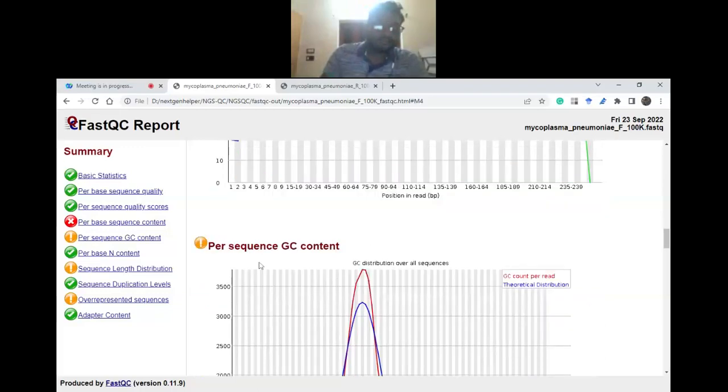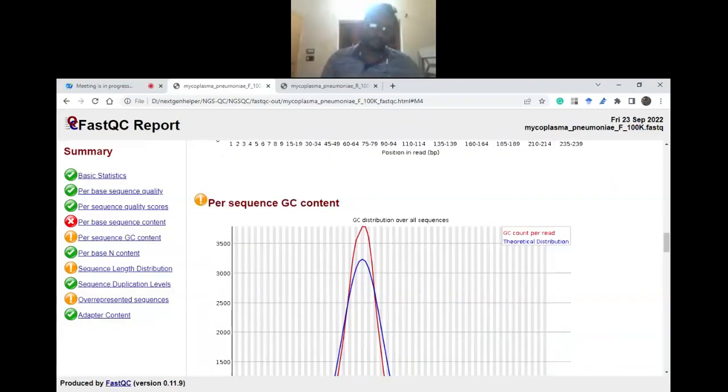Then, this is the FastQC after Trimmomatic. Pardon, I can't hear you clearly. Yes, sir, this is the FastQC after Trimmomatic. No, this is for the raw data. We will run Trimmomatic after. But it shows adapter content tick. That's why I asked. I will come to that. Okay.